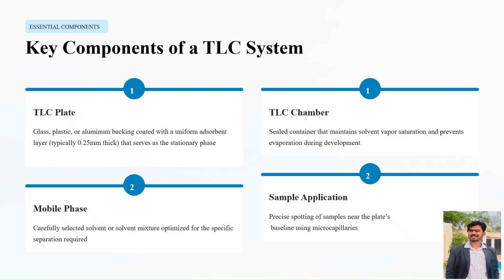Now, coming to the next slide, the key components of a TLC system. As I said before, the TLC plate is made up of glass, plastic, aluminium, etc. You can make a TLC plate in the laboratory; I will show you a video by which you can make a TLC plate in the lab.